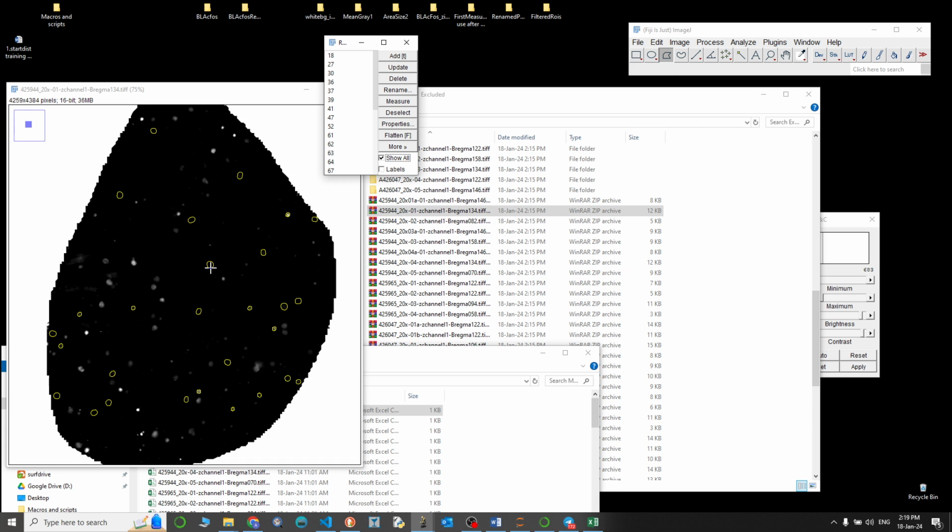Okay, this is a bit tricky step, but quite an important one. So time for step 18, I guess.